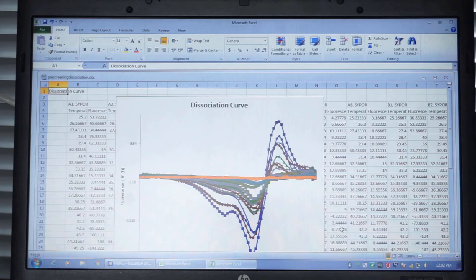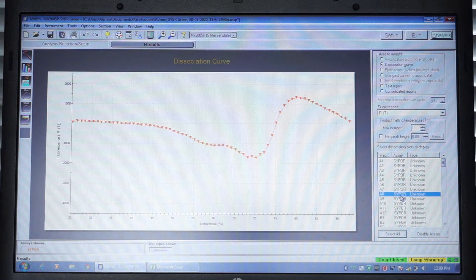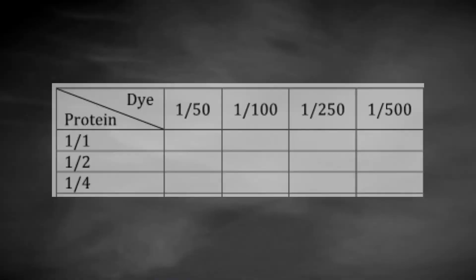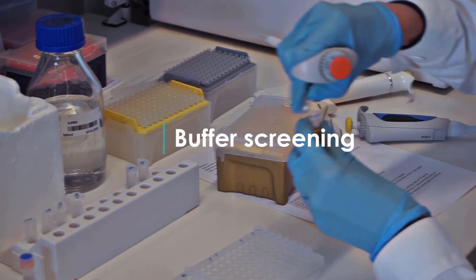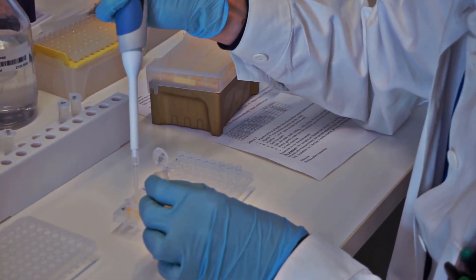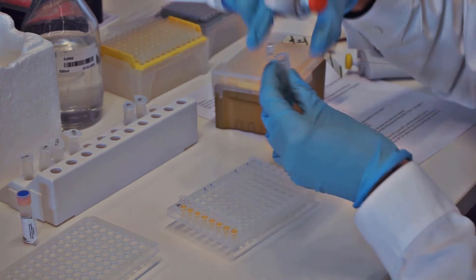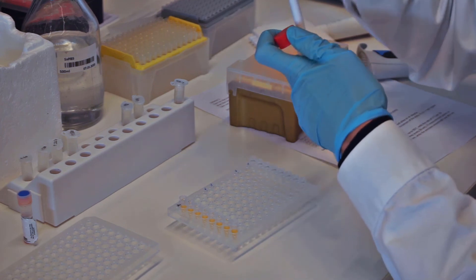In the pre-screening session, we used one single buffer condition to perform the experiment. From the results, we can analyze which protein-dye concentration has the best match and provides the highest melting temperature for the protein. After deciding on the protein-dye concentration to use, we will proceed to screen the buffer. We will prepare dye dilutions with water or buffer according to the protocol, and protein dilutions according to the protocol.